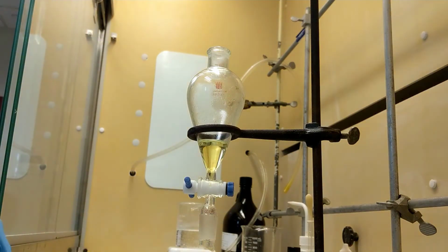Now I'm just going to do it all over again. Add another portion of NaOH and then extract it one more time. I'll see you guys when I'm done.